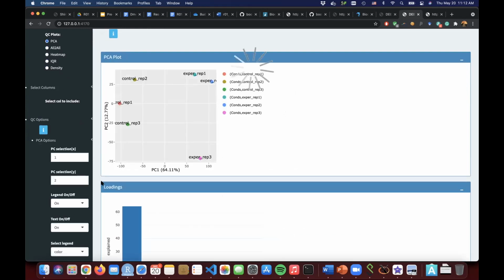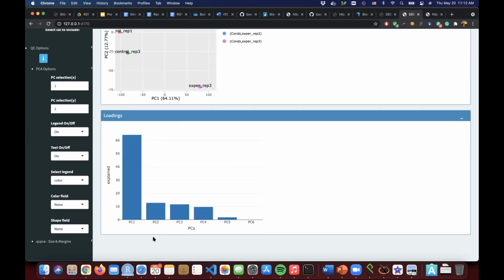By the way, one more thing I was going to tell you. In the PC plots, how can you decide which dimensions to explore more? When you see PC1 is very low and you see higher PC values here, PC3, 4, and 5, then you might want to check those PCs. Why is there a huge variance in this dimension? What explains this? Some data can be extremely complicated and can create variance in different dimensions that you might need to go and understand.